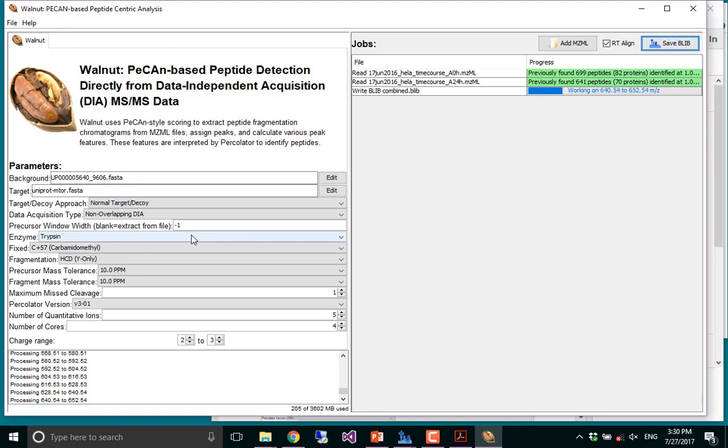And so basically, what we're trying to do here is DIA data. You were just looking at some of it, right? When you start talking about detecting tens or 20 or 30,000 peptides, there's no way you're going to search for every one of those in Skyline. There's just no way, right? Not for every sample, to figure out what transitions are being interfered with in any given sample. So we needed to make this automated and easy and fairly robust for being able to do the analysis. Otherwise, we would never actually be able to do DIA workflows in a reasonable capacity.